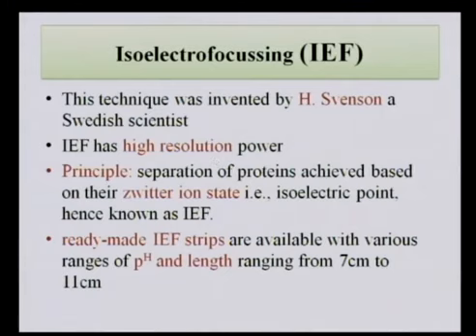Coming to the principle of this electrophoresis, that is IEF, the separation of proteins is achieved based on the zwitterion state, that is the isoelectric point. Hence we call it isoelectric focusing. If you recall the structure of proteins, they are made up of amino acids, and there are various types of amino acids like acidic, basic, charged and uncharged ones. When you dissolve these proteins in a suitable buffer, they will obtain a particular charge.